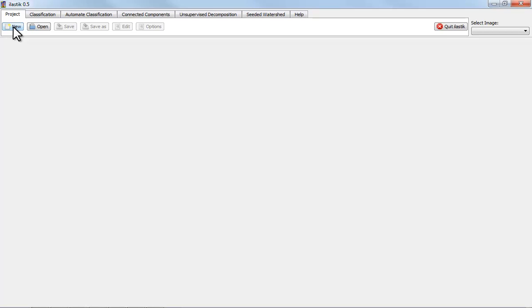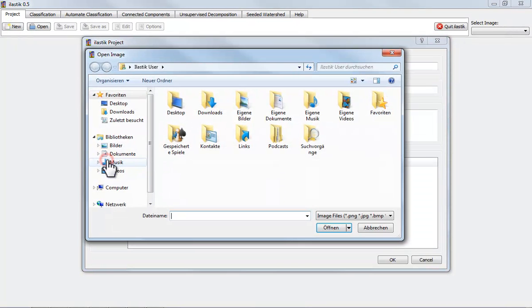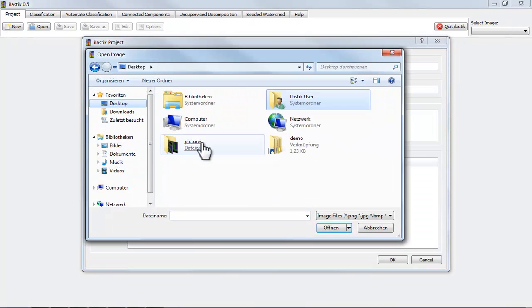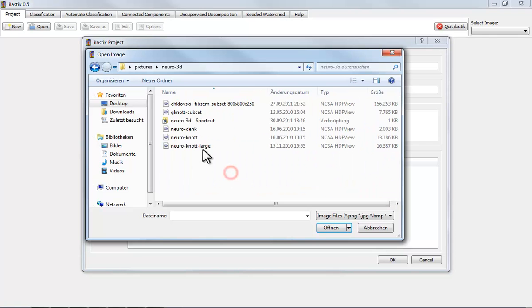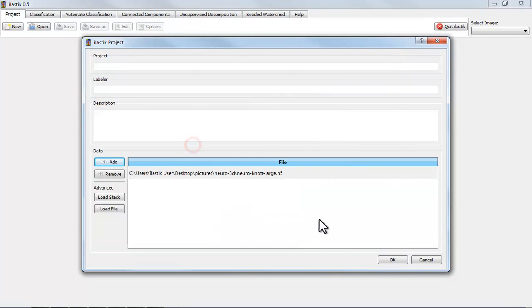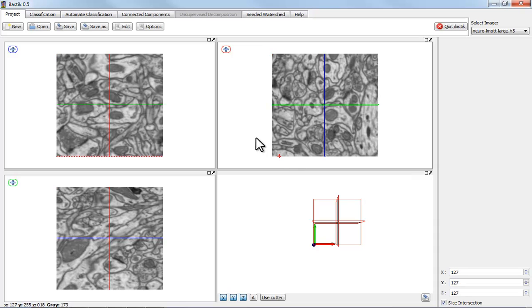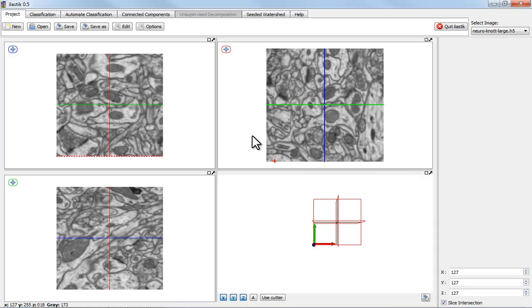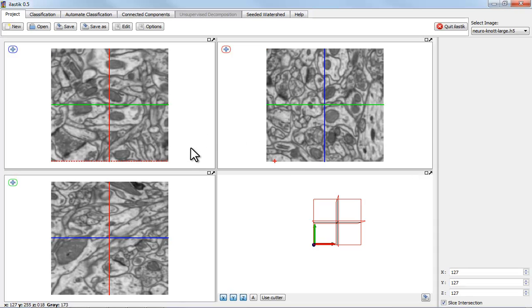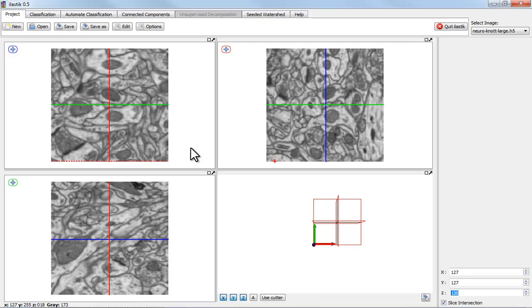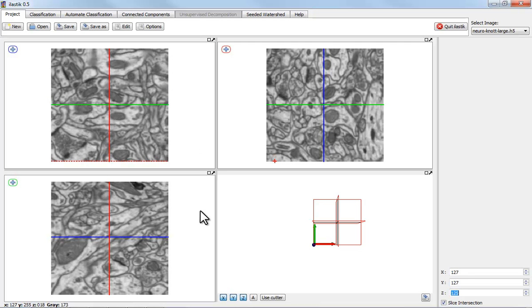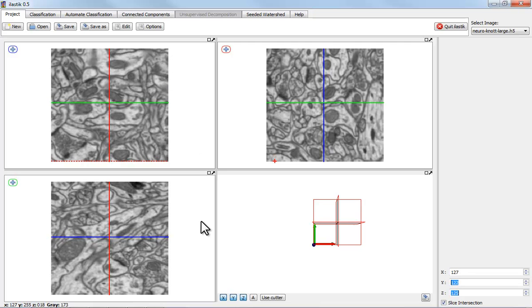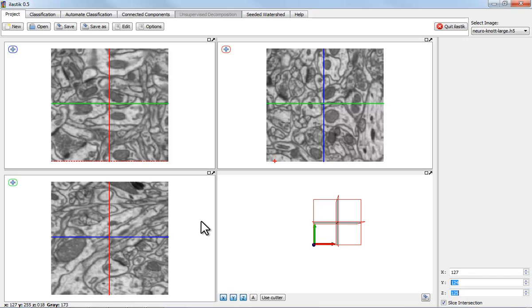First, I'm going to load some data. These are about 10 million voxels. The data is courtesy of Graham Knott at the EPF Lausanne and you see that we have a very nice isotropic resolution here.